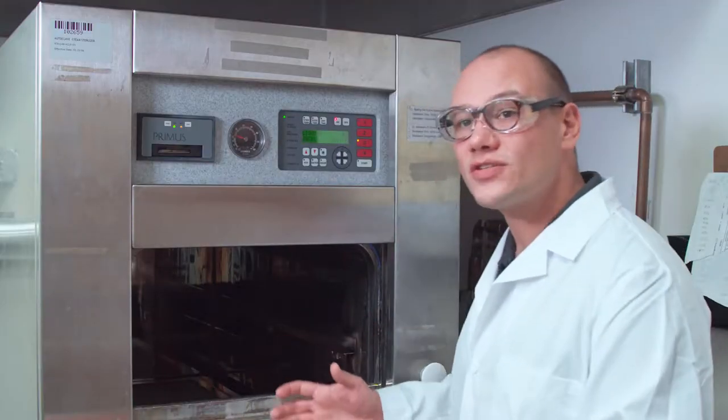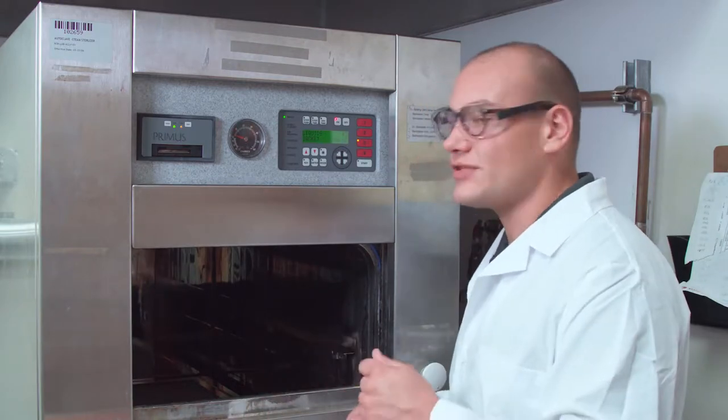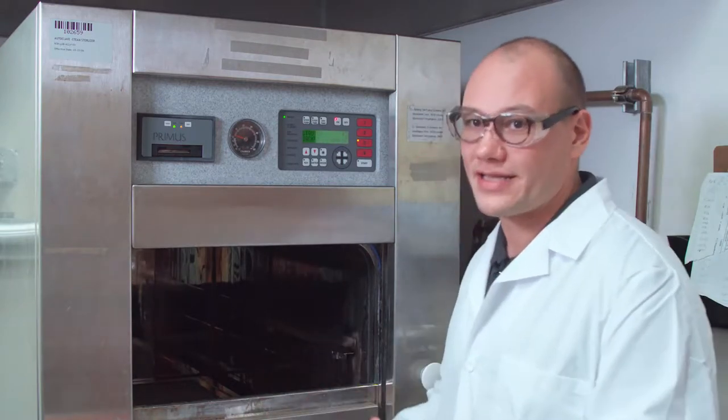The most common types of injuries associated with autoclaves are burns because autoclaves use heat in order to sterilize anything placed inside.